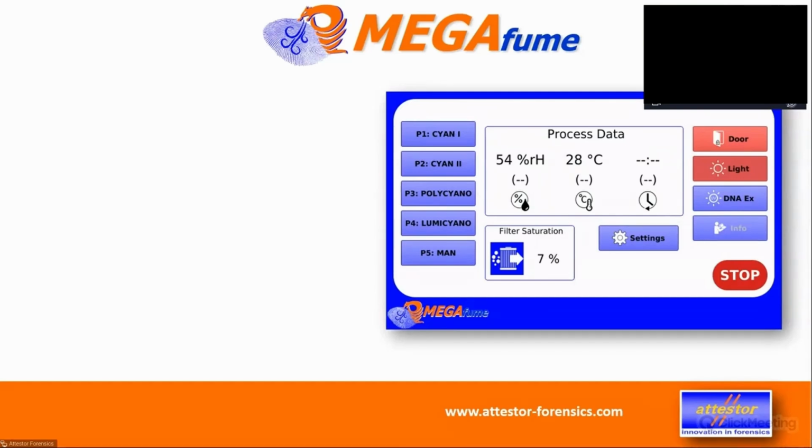In the center, you see all the processing data. At the moment, a lot of it is blanked out, but when you are inside a cycle, you will always have displayed the current humidity in the chamber and the current temperature in the chamber. Below, in that bracket where you at the moment just have the dashes, would be displayed the set points where we want to go. And then the last column is the timer. It will tell you how long this step is supposed to take, and above you will see a counter counting backwards. On the right side, you see a button for the door to be opened.